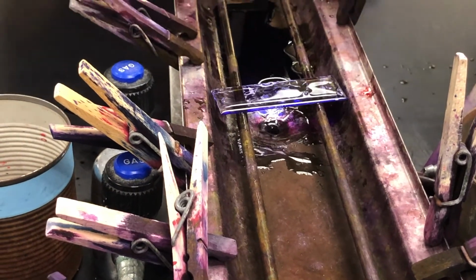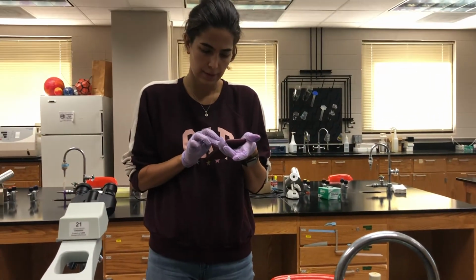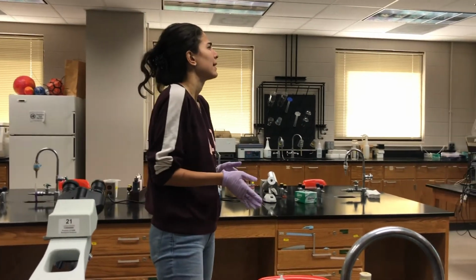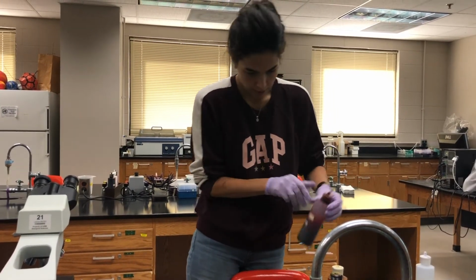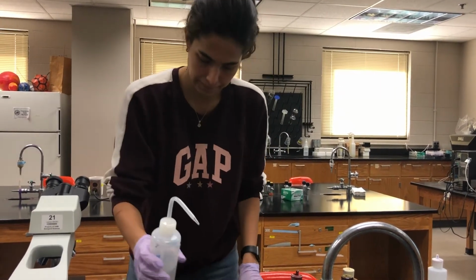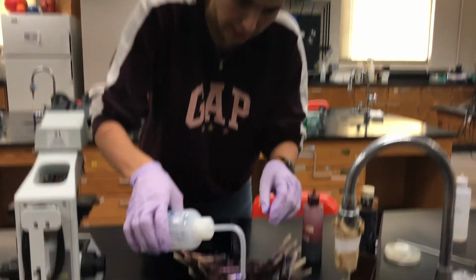Okay. We will wait for this time for 20 seconds, and then rinse with water again. Ethanol. Okay. Again, water.